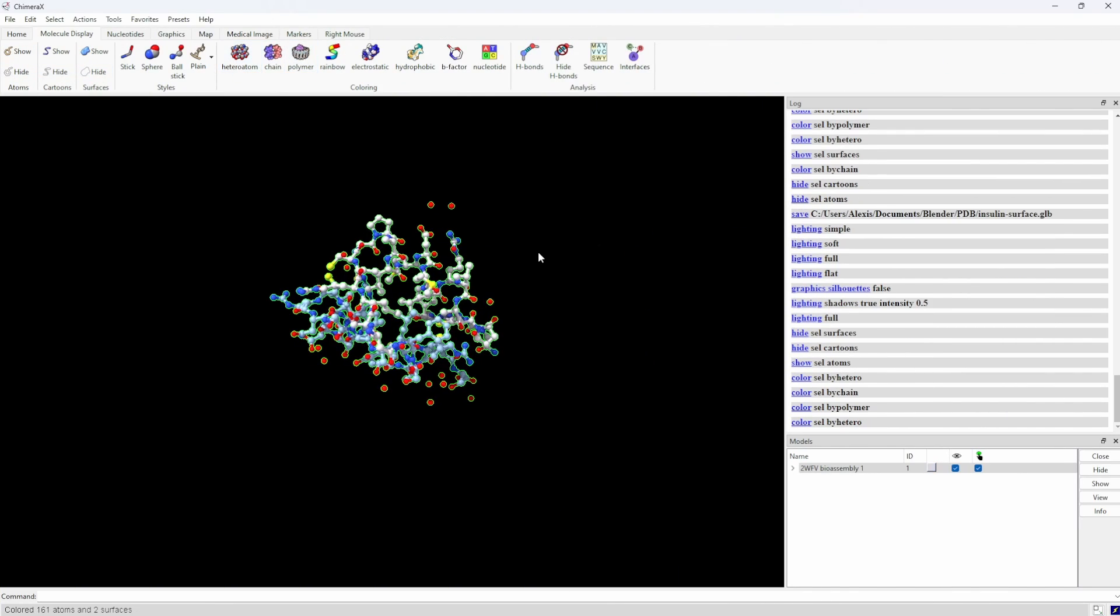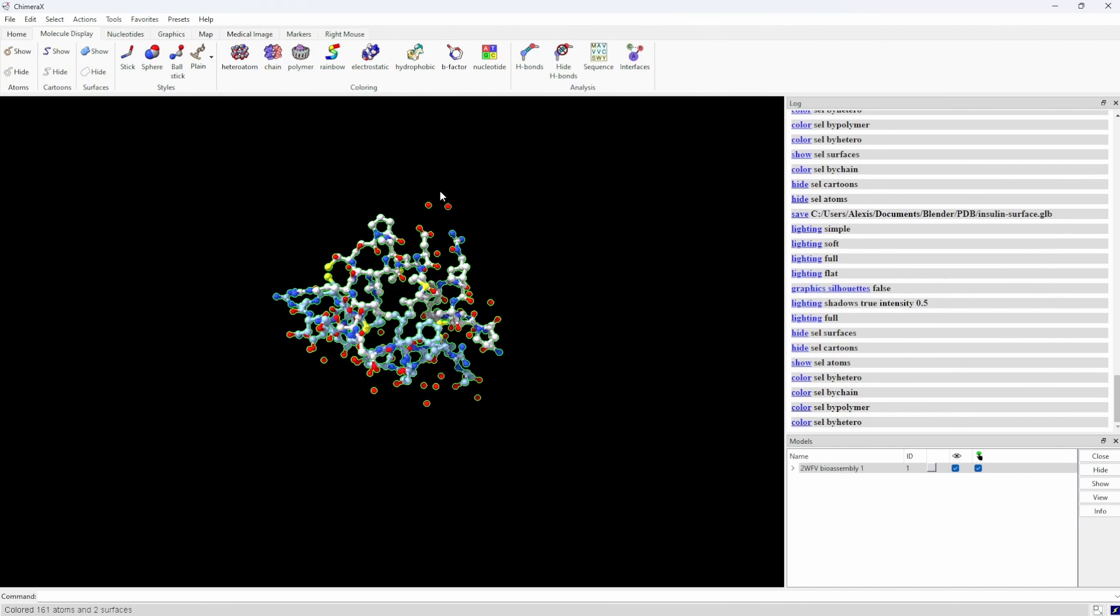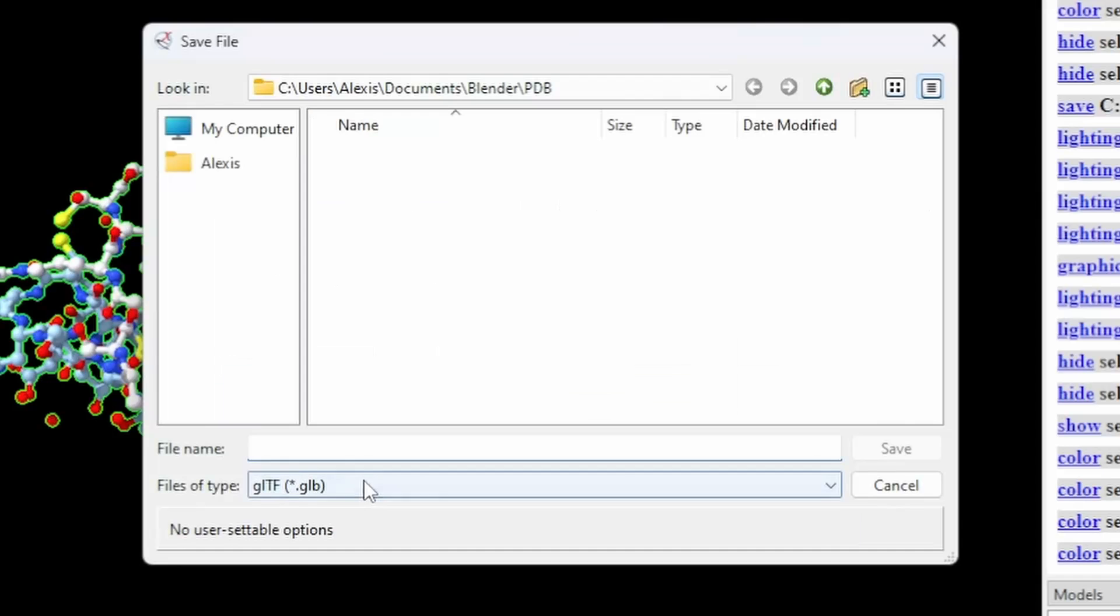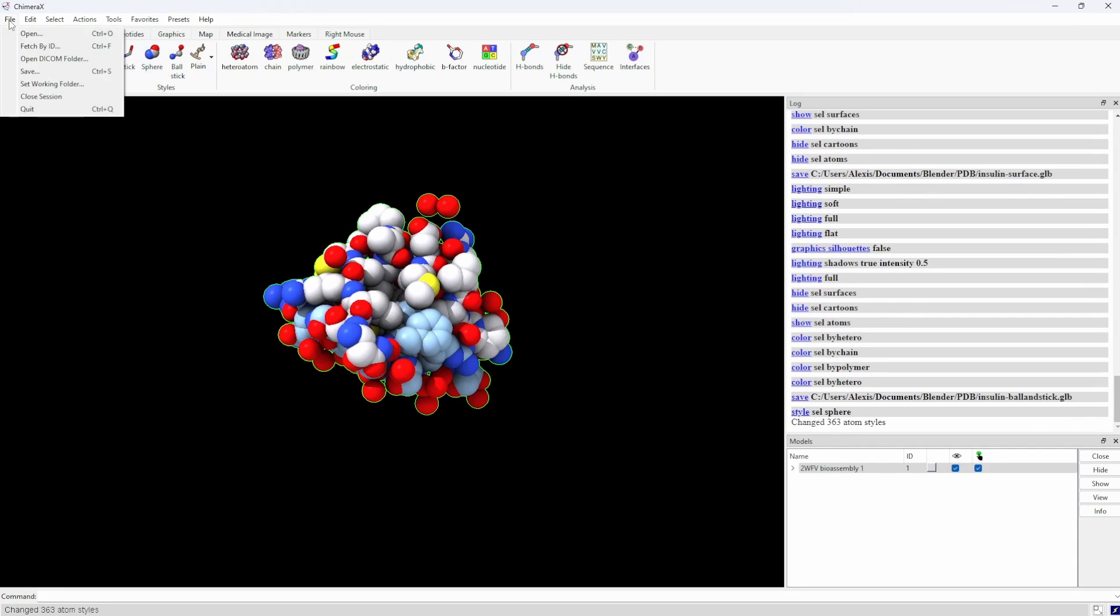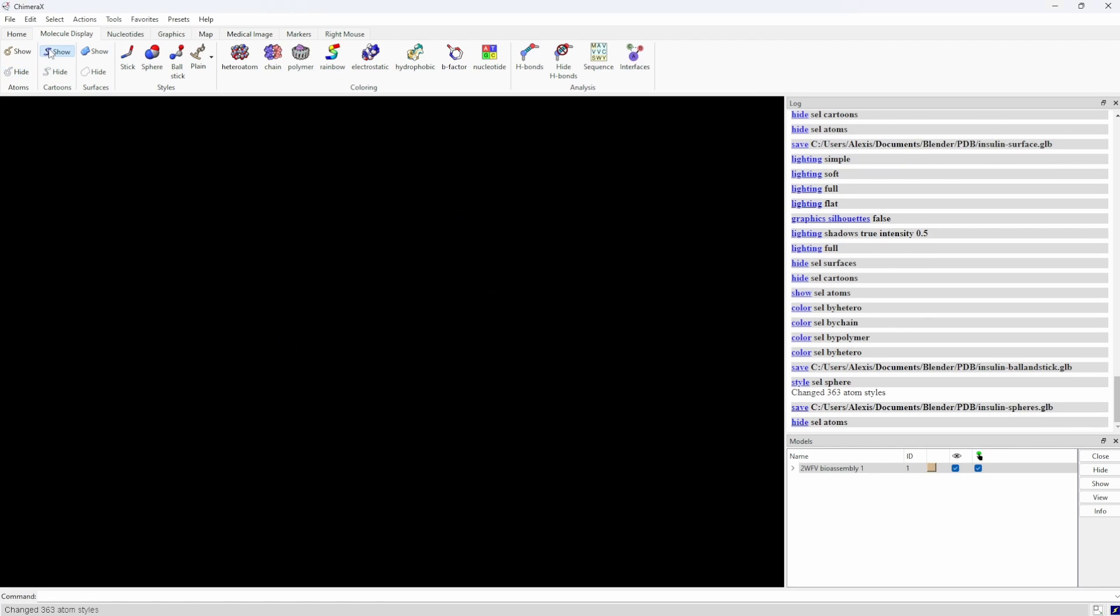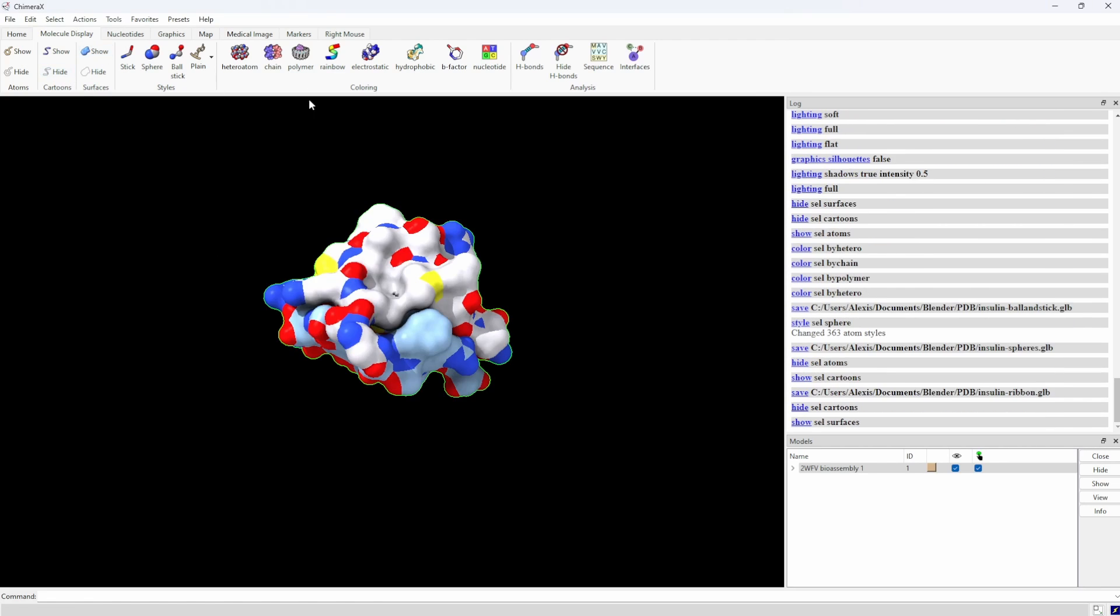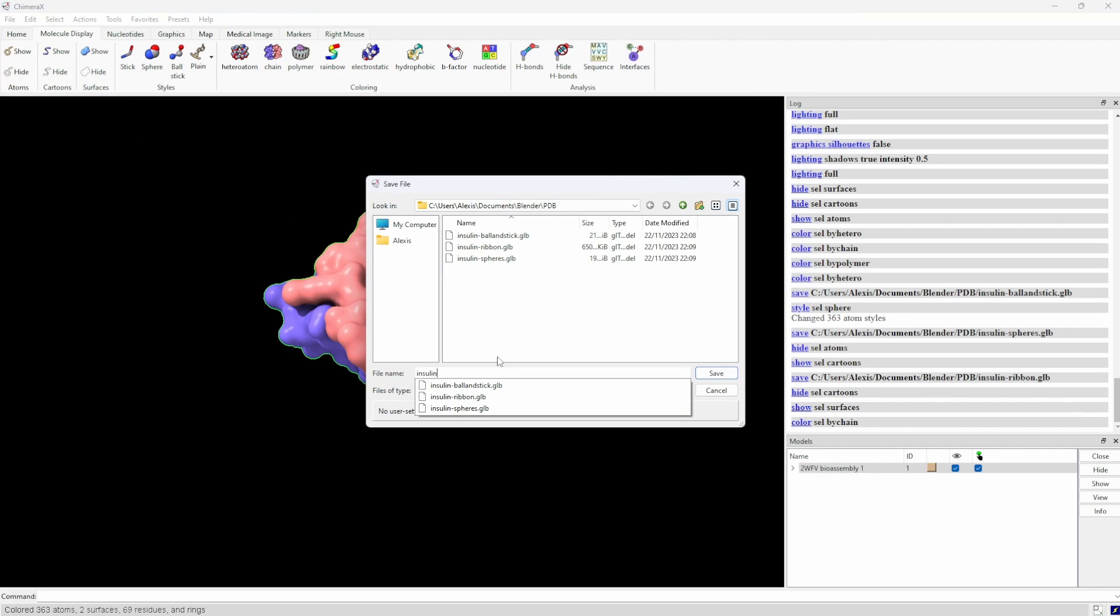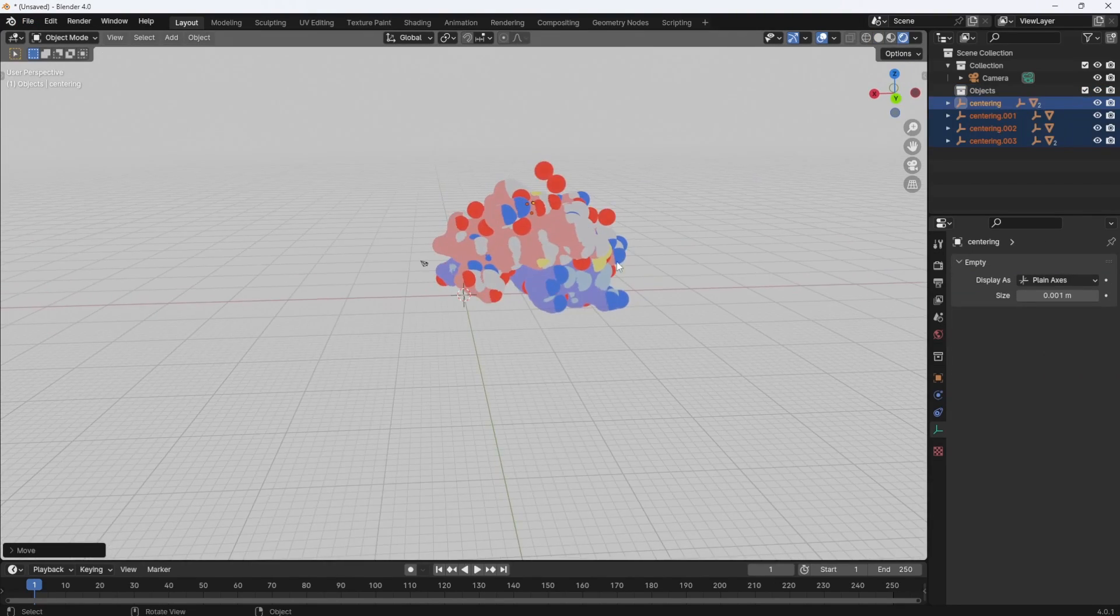Luckily, Chimera made it super easy for us. All we have to do is select our construct and save our file in the .glb format. I'll do this for every geometry, just to show. And you can directly import the glb file with Blender.